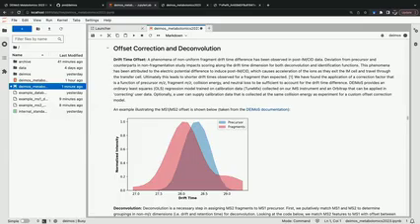And so we've tested and introduced an equation that is a function of the precursor mass to charge, the fragment mass to charge, the collision energy, as well as the neutral loss. And we apply this correction, which we'll show in the code below, to correct the fragment drift times, which improves our deconvolution.